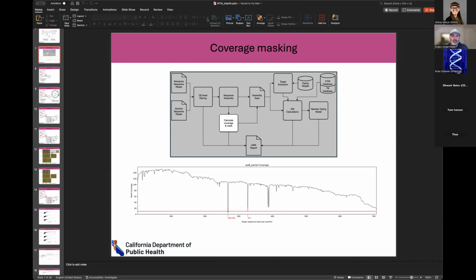So if you say 10 or whatever the case may be, otherwise you would say an N or an indel there. So I'm wondering how others are thinking about the 10x cutoff as a whole and the application in this case, because I think as a group we need to understand this 10x much better than we do.